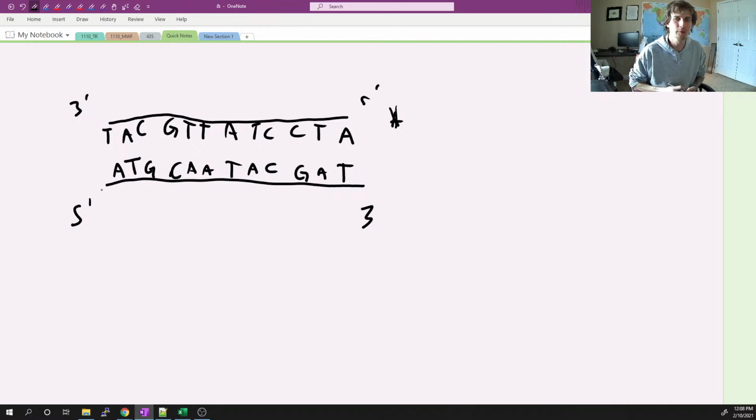Reverse complement the sequence. So you'll see in databases that we only get one strand because having two strands is redundant. And also, we should recognize that whenever we ask for a gene sequence, we get the coding sequence.